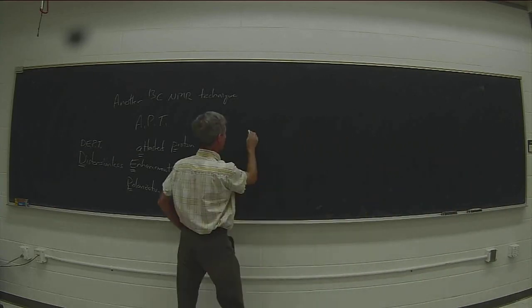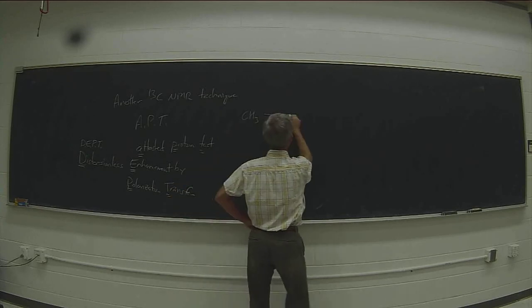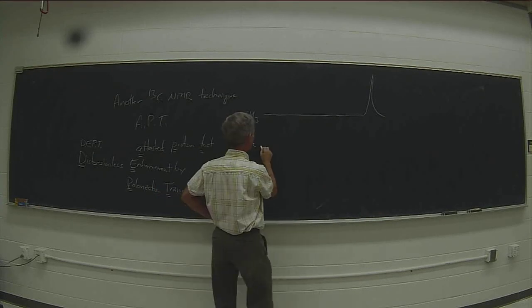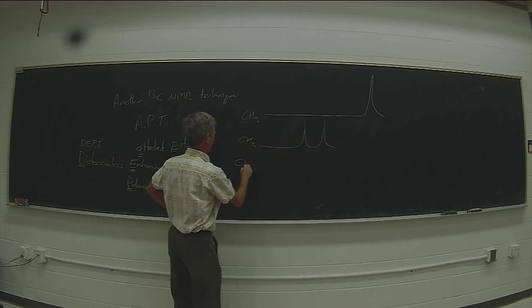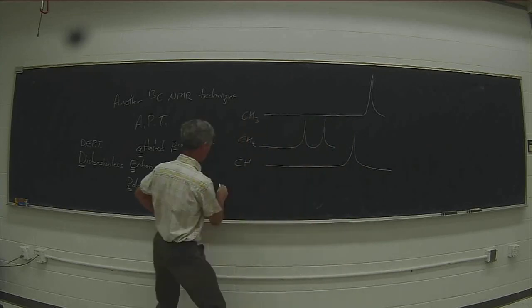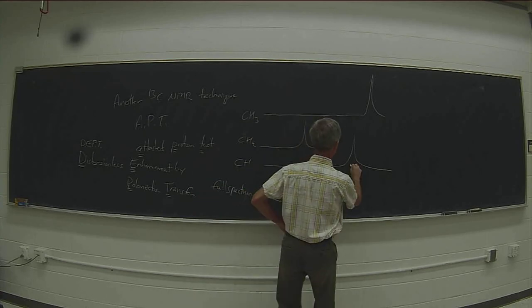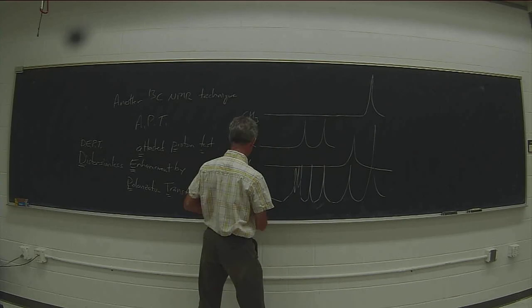So for that same example, we would see our CH3 group with just that one peak. We'd see our CH2 group with our 2 peaks. And then we would see our CH group. And then we see the full spectrum, which would have the triplet for the CDCl3.